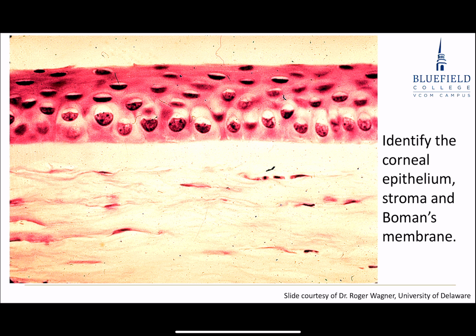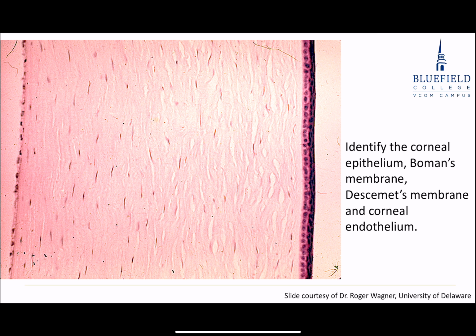All right, last one to take a look at here. Once again, I've got my stratified squamous. This time it's only a few cell layers thick, isn't it? Maybe 3. Okay, don't know why it's not 7 like the previous one, but definitely multiple layers. And you can see the nuclei are flattening out, long axis parallel to the surface.